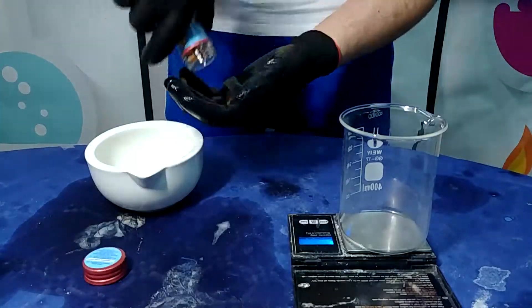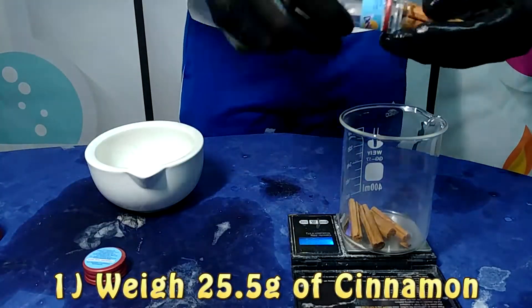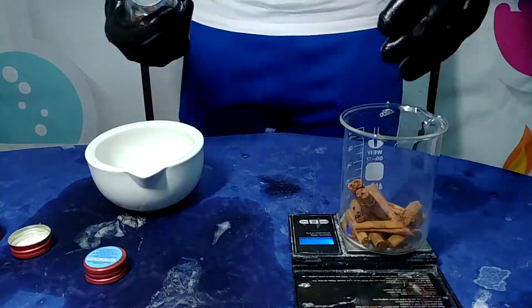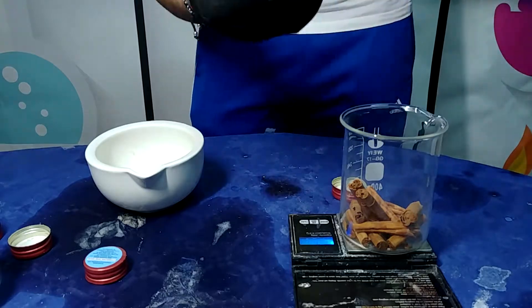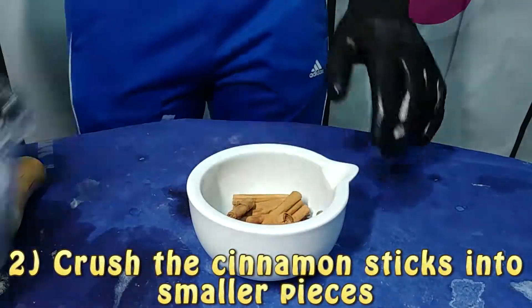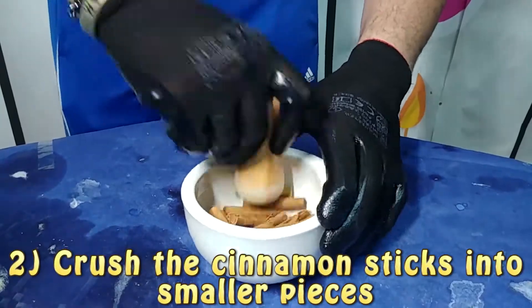So for this experiment first we are going to weigh 25.5 grams of cinnamon bark. Then we are going to take this cinnamon bark and crush it into small pieces in a mortar. After that we are going to put this cinnamon into our boiling flask and then add 200 ml of water and boil everything.